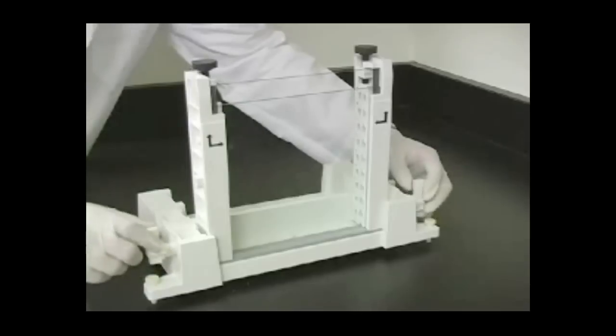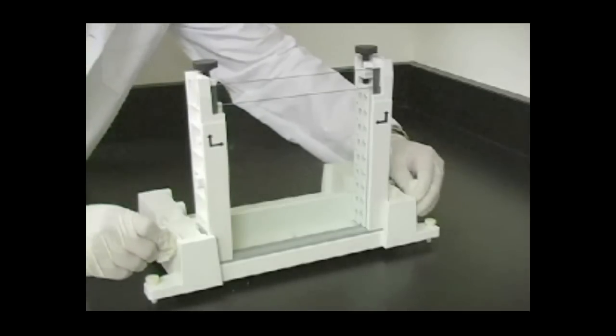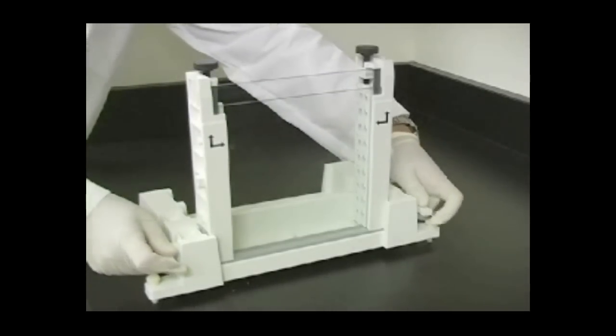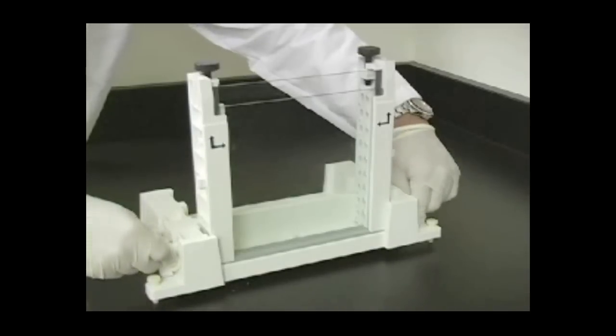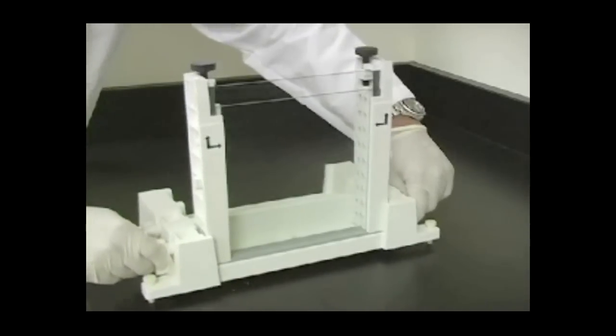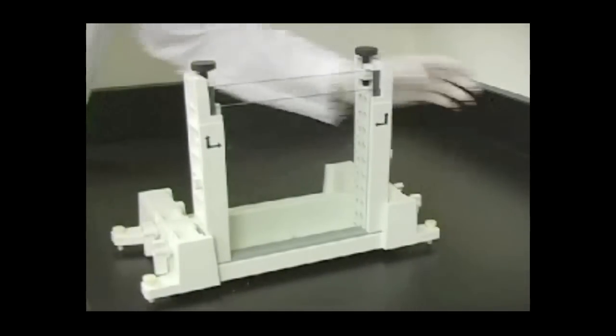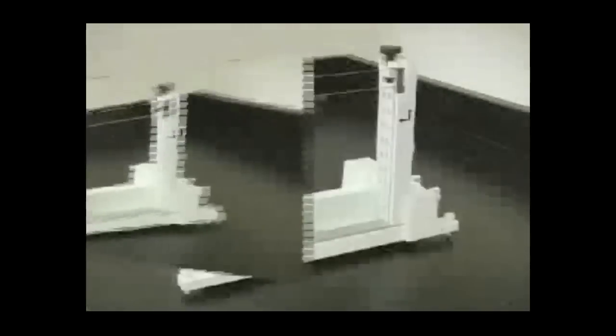Orient the handles of the cams upward, push the cams in, and turn them 180 degrees so that the handles of the cams point downward. You should feel some resistance. The sandwich should now be tightly secured in the casting stand.